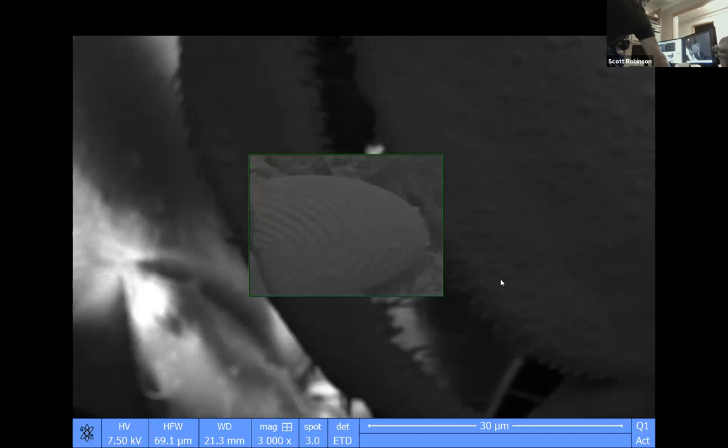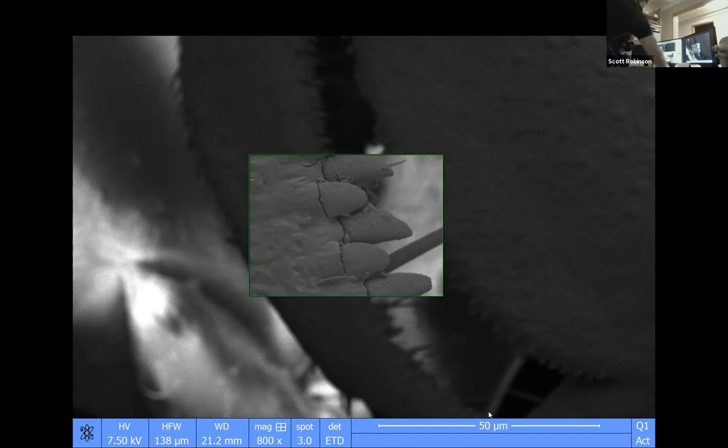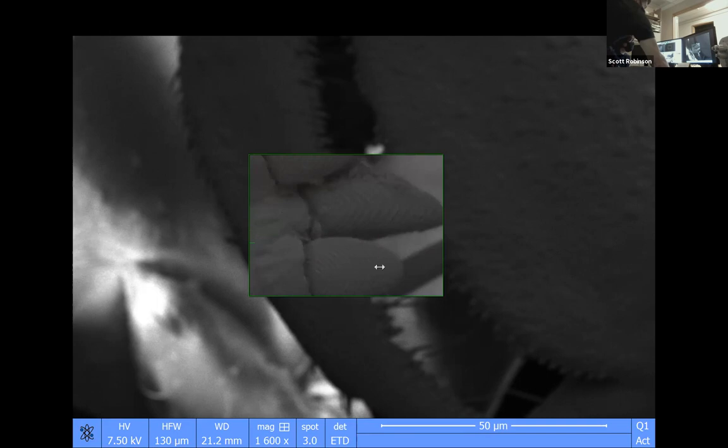So you can see that these really beautiful features right here are what the assassin bug is using, and they're sitting on either side. They're facing each other, so they're almost like teeth. And those little tiny, really beautiful teeth are what the assassin bug uses to grab its prey when it wants to kill its prey and bite them. It can hold them really well.